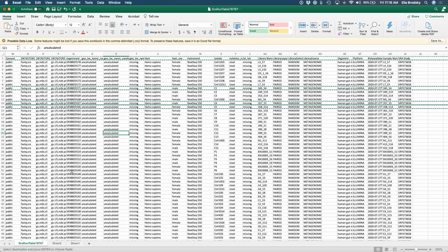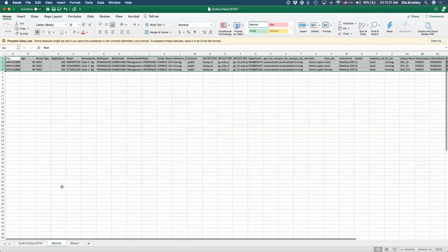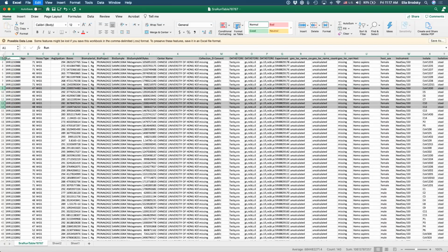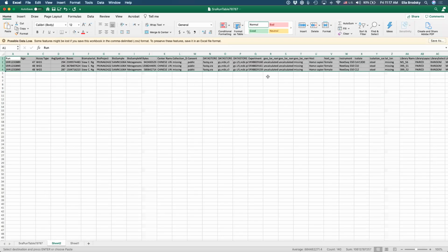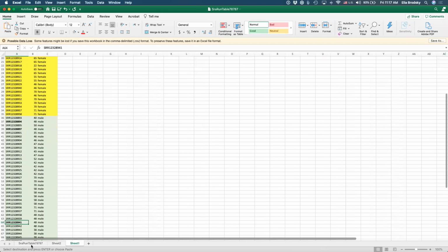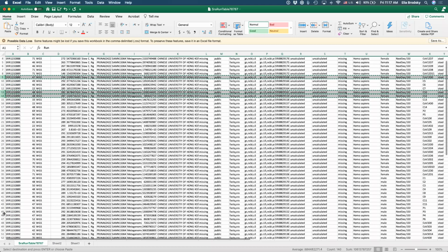Okay, so which ones did we have here? We had 9, 13, and 14. So we're just going to put these here. Okay, let's just check. These are all female, great. And for our male, we had 37, 39, and 64.